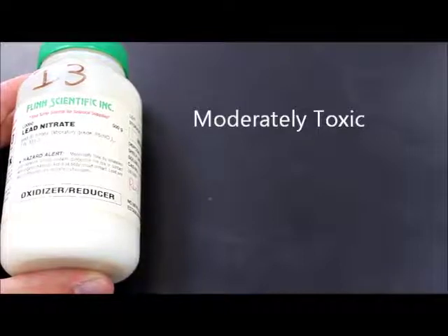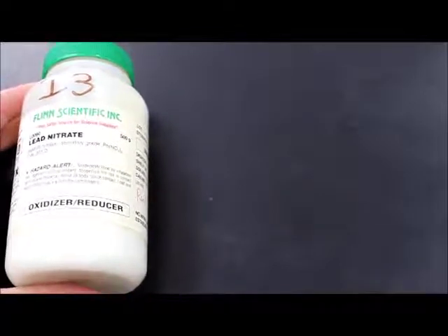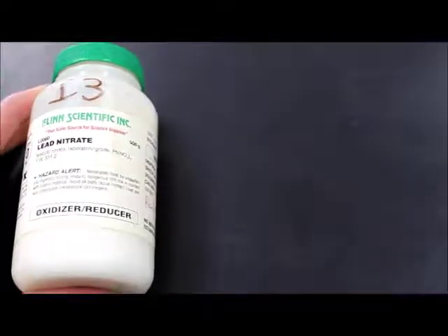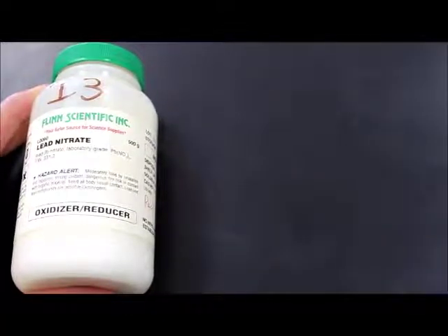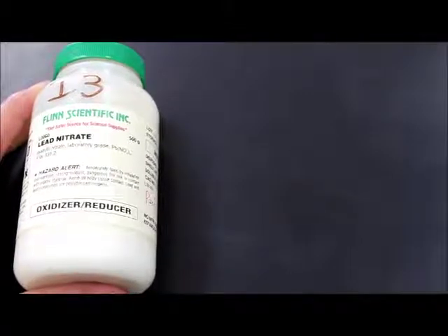Now, you don't want to get it on your fingers, you don't want to get it in your eyes, you don't want to ingest it. Ingesting is the easy one to do. But if you got a little bit on your fingers and you rubbed your eyes, this could cause a little bit of irritation and a problem.